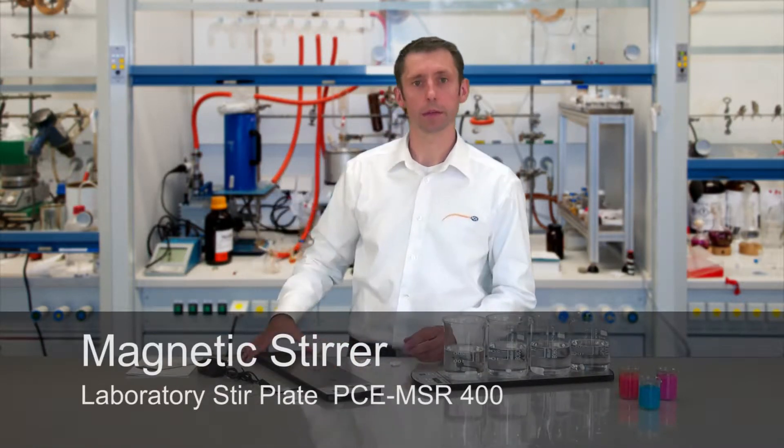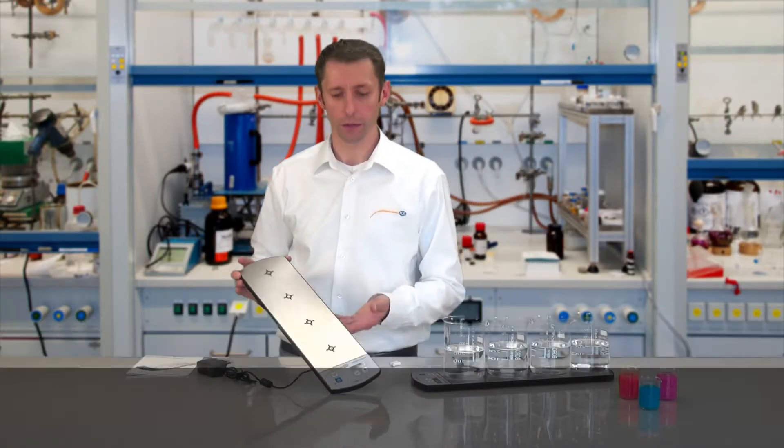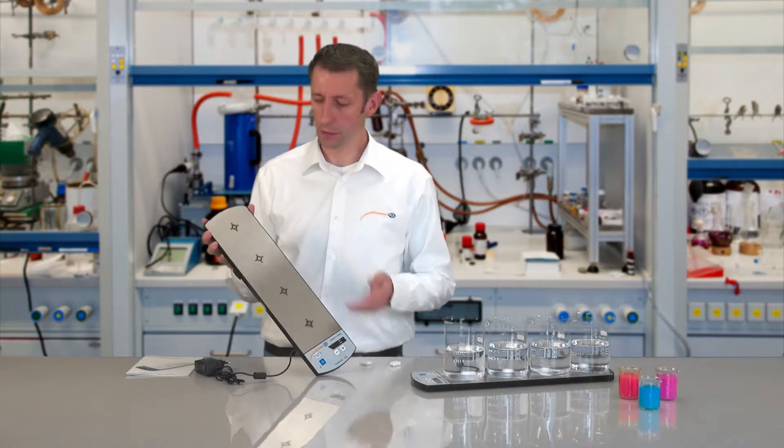The Magnet Stirrer PC-MSR400 is an induction magnet stirrer which has four stirring surfaces.